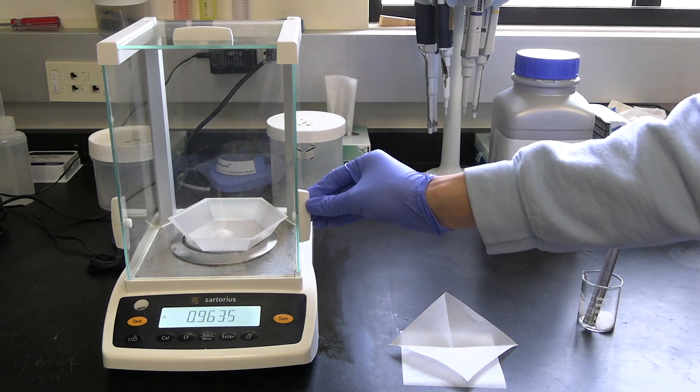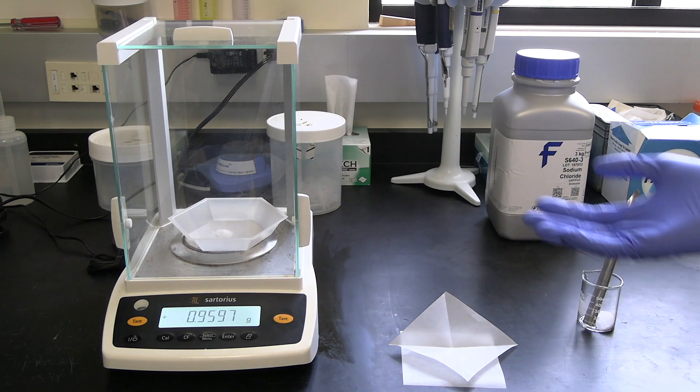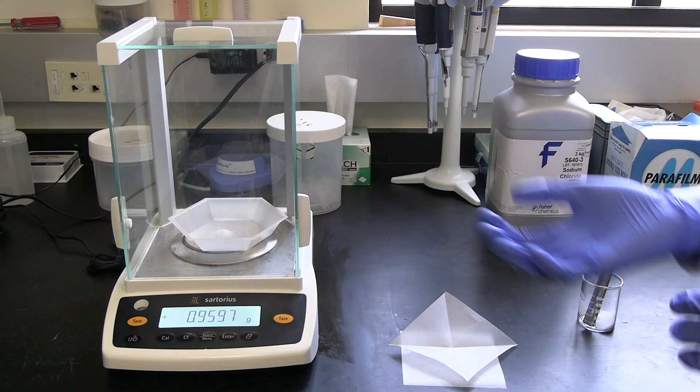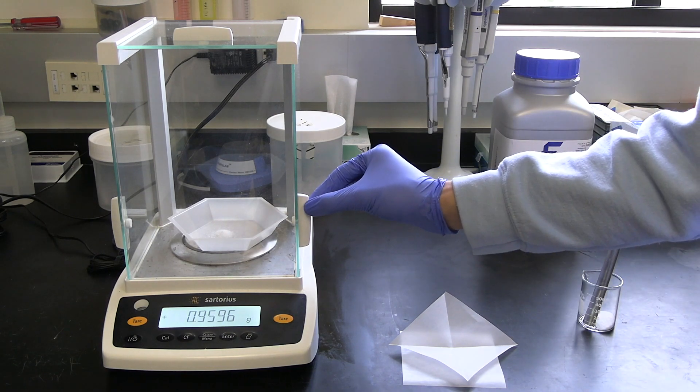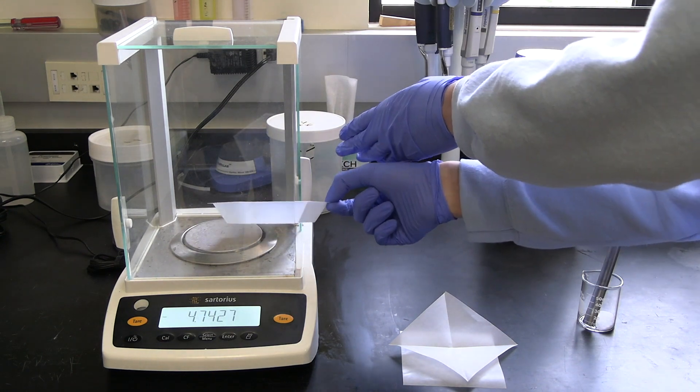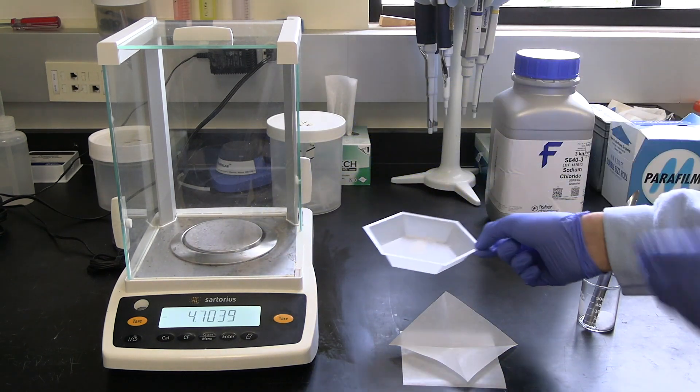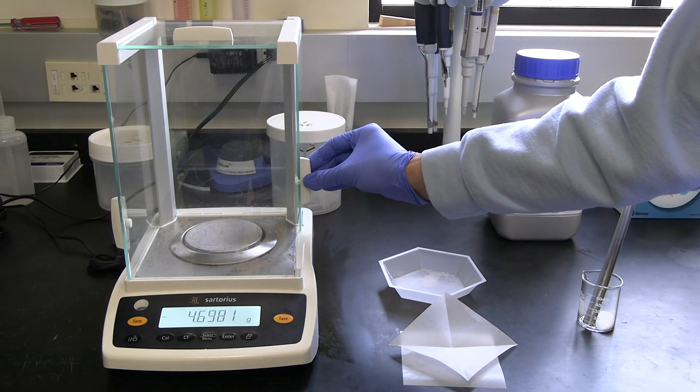And then we're going to close up the machine, wait for our measurement to stabilize, which it looks like it has. So we have about one gram of NaCl. And once you're done weighing, you can just remove your weigh boat and use or dispose of the solid, whichever you want to do.